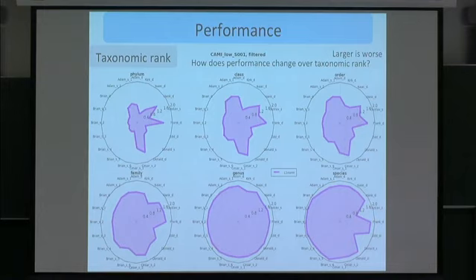These little notches right here are due to the fact that these two methods don't give any species level predictions, and because of that, your L1 norm is going to be equal to 1. L1 norm at max is 2, at minimum it's 0, and if one of the vectors is all zeros and the other vector sums to 1, then of course that difference is going to be 1. So this just indicates that those two methods didn't make any assignments there.